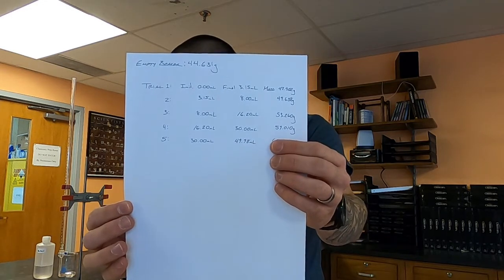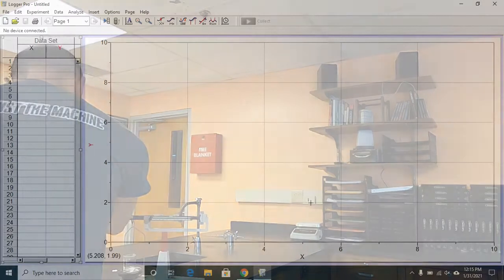So I've got all of my data collected. Now it's really just time to clean up and then analyze the results through a graph. So now we're going to be using Logger Pro to analyze the data. I'm going to go back to the handout for the lab so you can see step by step what it says and then I'll do that on Logger Pro.